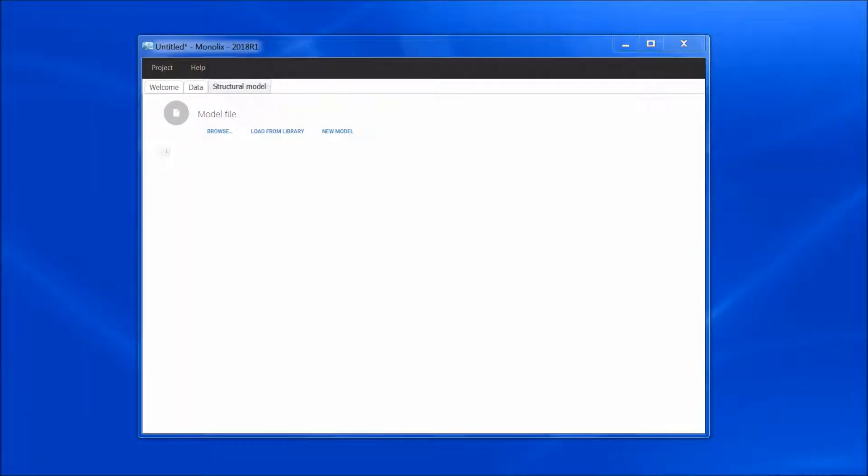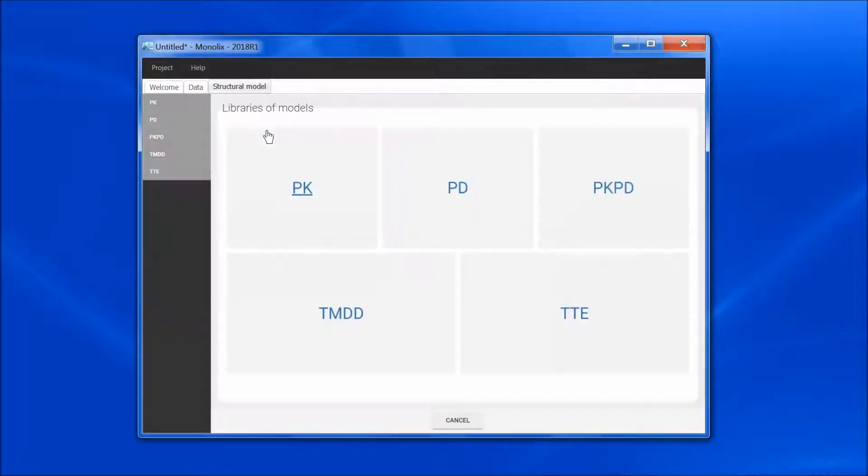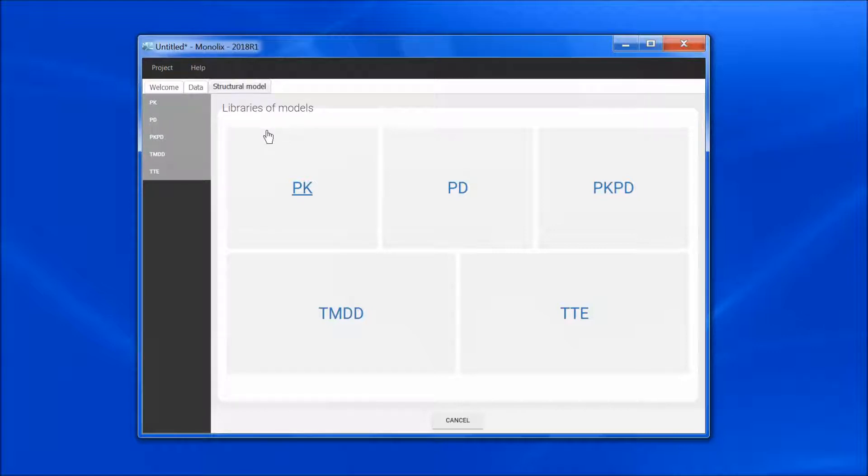Today, I would like to present the built-in model libraries. In the Structural Model tab, if I select Load from Library, I have five different libraries from which I can pick a model.